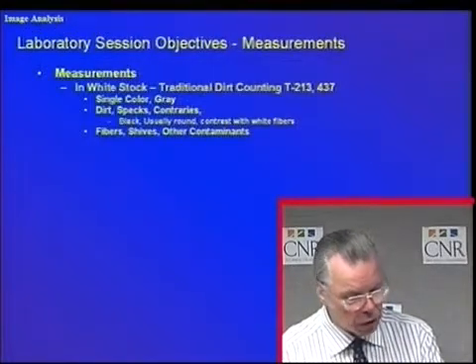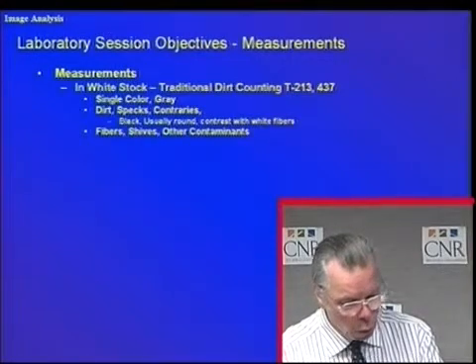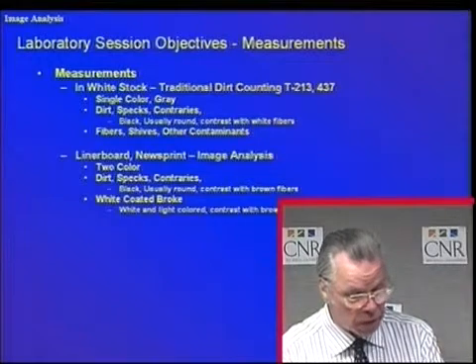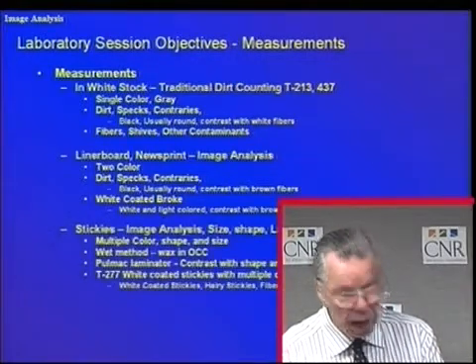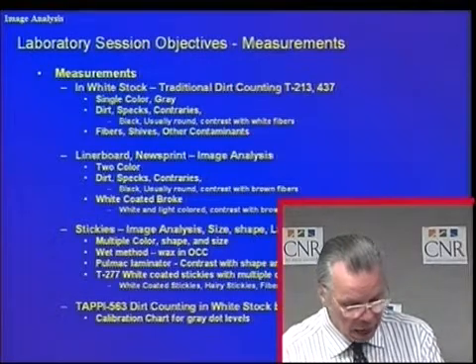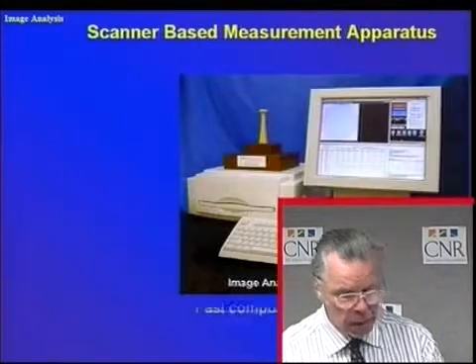The measurements, we're going to use primarily white stock, but we can also use OCC that is used in the production of linerboard. And last, we will spend some time talking about stickies and TAPPI 563.